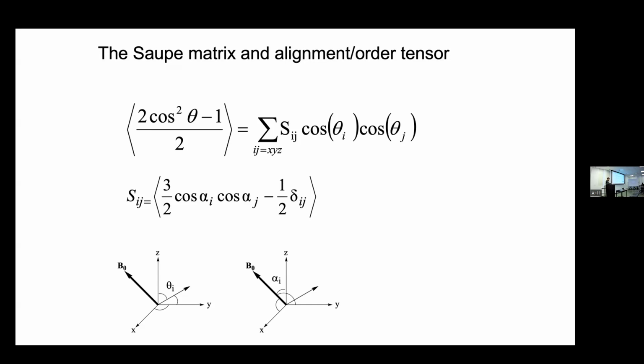If, on the other hand, you give me an ensemble model, and let's say you have some great force field or a great model that gives the right ensemble, then that ensemble will predict the RDCs correctly. But it's still tricky, because when you change the structure, you also change the alignment tensor. What I just told you assumes the alignment tensor is fixed, and the bond vectors just change with it. But the fact is, when I change the shape of a molecule, I also change its alignment tensor. So I have to be able to account for alignment tensor variations as well.